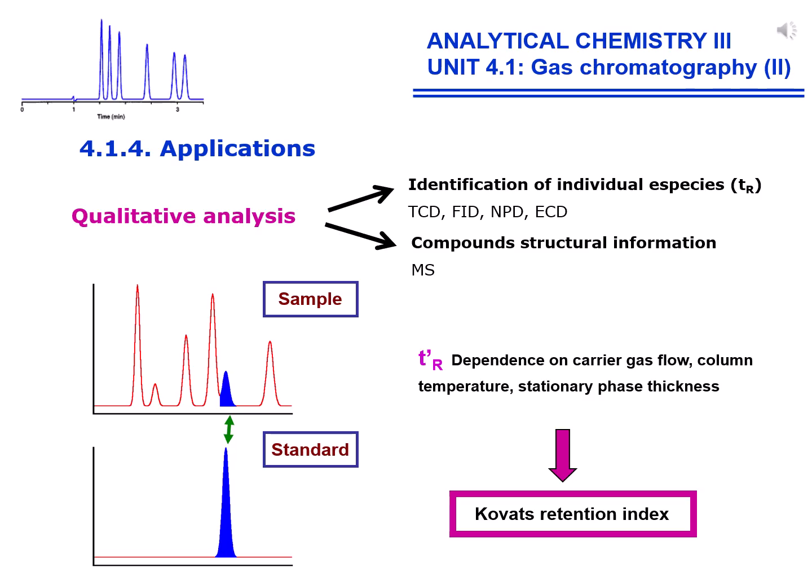As we have said in Unit 3, chromatography is employed with identification purposes, qualitative analysis, but also to quantify the separated target compounds, quantitative analysis. For the first case, qualitative analysis, it's possible to identify species in an unknown sample using retention times as a source of information.